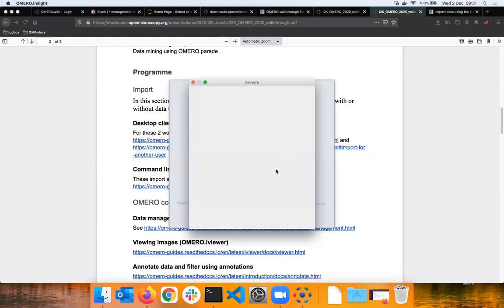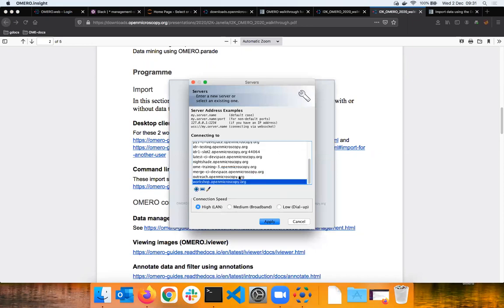I have here a spanner where I have to choose the right server, such as this. The server address is workshop.openmicroscopy.org. Maybe we can start pinging you. I've put that, but the first time you come, that list of addresses is what Peter has already, the servers Peter has connected to. If you come the first time, you won't have anything in that list. That needs to be clarified.